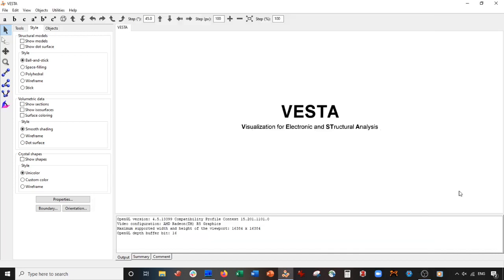Hey everybody, how's it going? We have another exciting VESTA tutorial today. We will be cutting the 110 surface of rutile titanium dioxide. Usually it's more popular to use anatase titanium dioxide, but today we're going to use rutile. So without further ado, let us cut the 110 surface of rutile titanium dioxide, do a basis change, and we'll have a new unit cell where the exposed face is the 110 face.